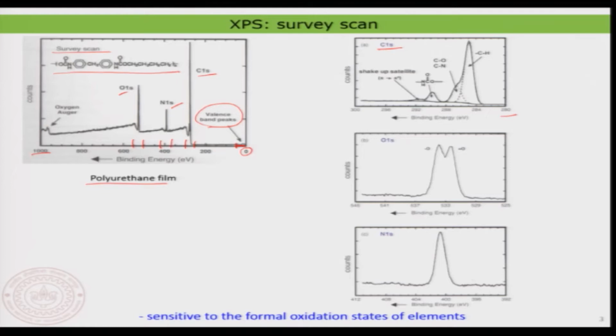Depending on the case. So, here you clearly see that we will look in greater detail in the next slide, but here you quickly look into the system. You already see that I have alkyl carbon, then I have aromatic carbon, and you clearly see that I can also identify many different peaks, and each of these peaks corresponds to different types of carbons that are present within the polymer chain.